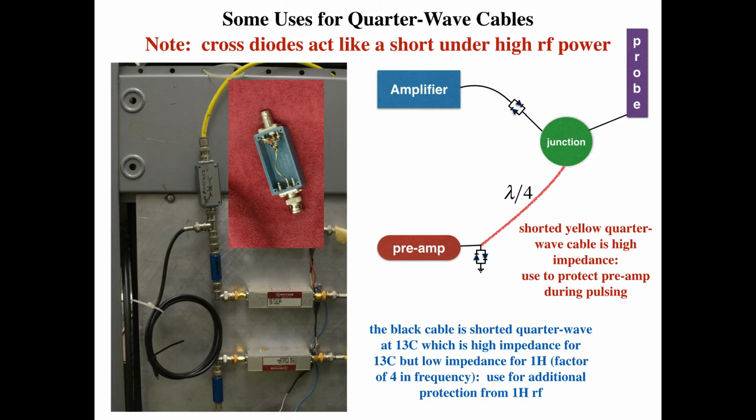And you notice in here there's a lot of diodes. There's about 16 diodes in here. These diodes have to handle a lot of current. If you only put one or two sets of cross diodes in there, they probably won't last very long. So we put quite a number in there. And so that's actually what's in this box here.